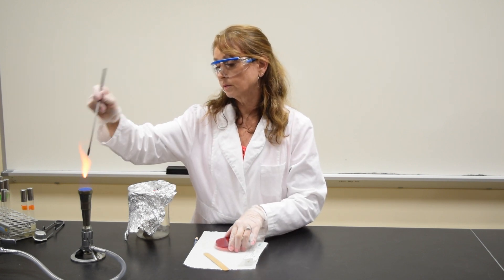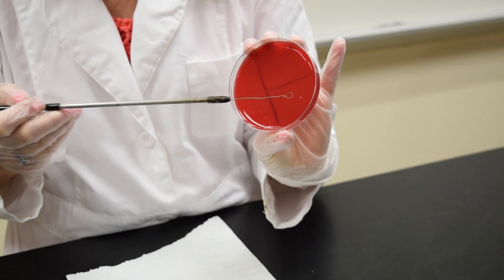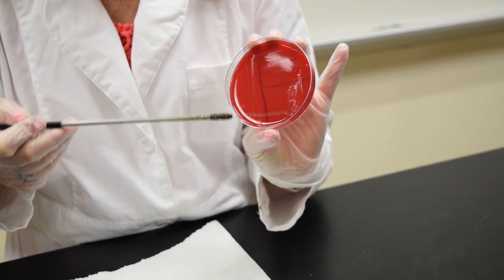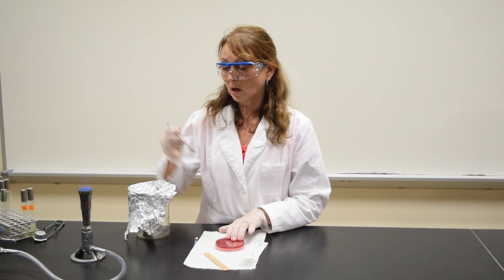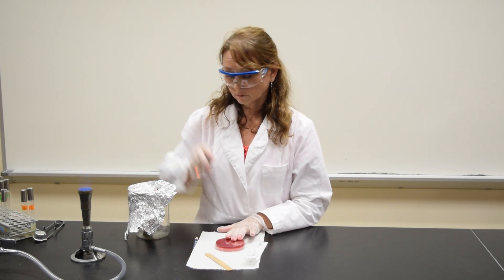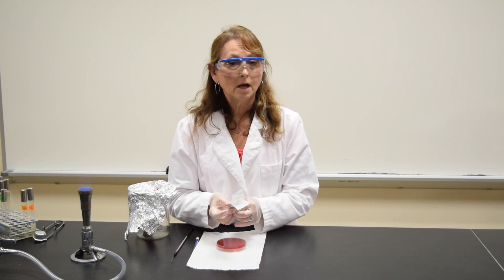Re-sterilize your loop. Touch the hot loop in area three to cool it. Go into area two once, pull it out, streak, and stop at the line. Sterilize your loop. Your tongue depressor and swab can go into the biohazard container.